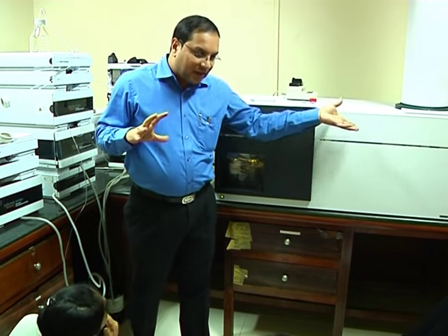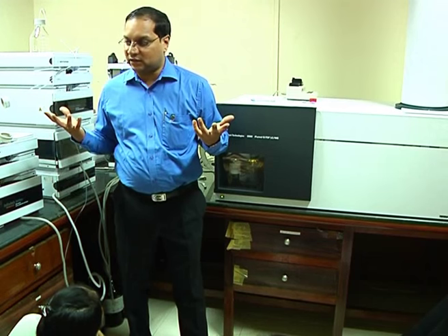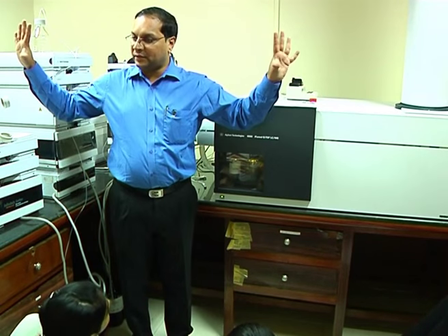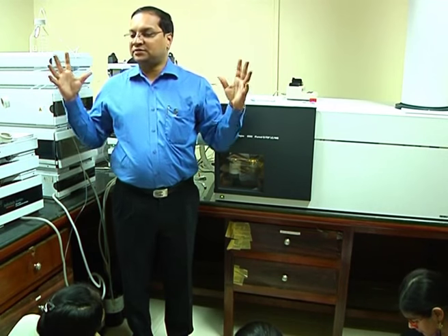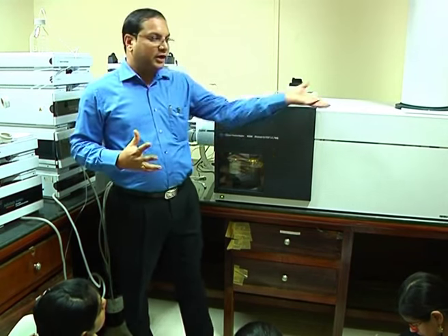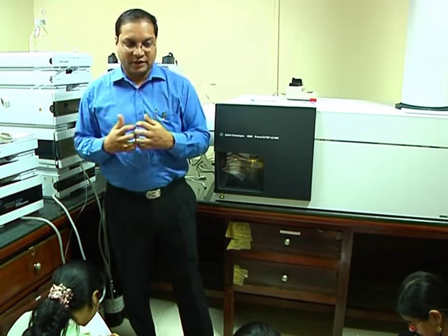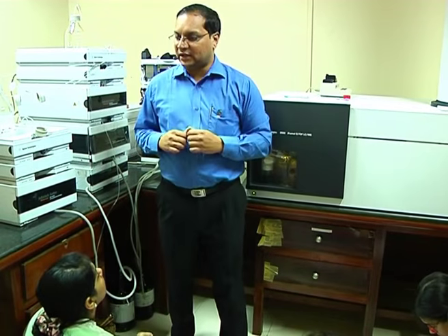If there are two different analyzers, like here in this case quadrupole and time of flight, then it is also called a hybrid mass analyzer, because quadrupole in itself is a mass analyzer, and time of flight in itself is a mass analyzer. Two different mass analyzers coupled with the functionality of MS-MS becomes a hybrid mass analyzer or hybrid tandem MS. In this case, quadrupole and time of flight are also talking to each other, also called data dependent acquisition and all those things. You might have heard them. And we need to have two different analyzers.